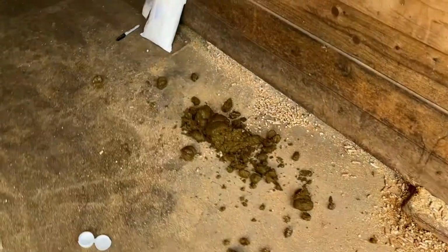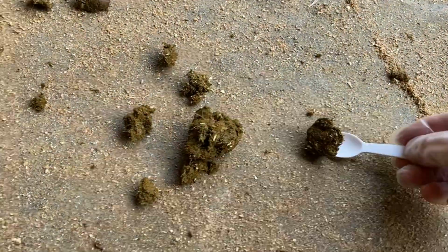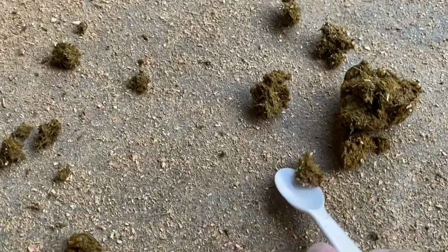the surface. After approximately 20 minutes, enough time has elapsed to allow any eggs present to float to the surface. The surface is then skimmed off with a cover slip and examined under a microscope. A veterinary parasitologist then reviews the samples and produces a report.